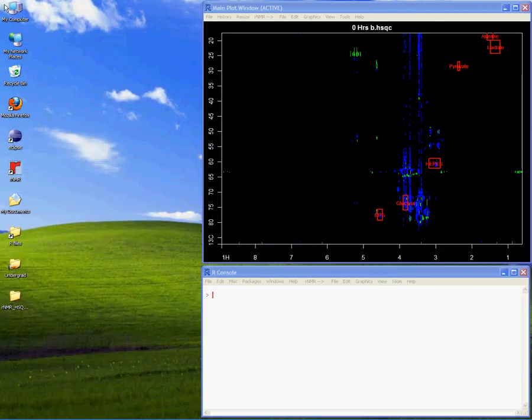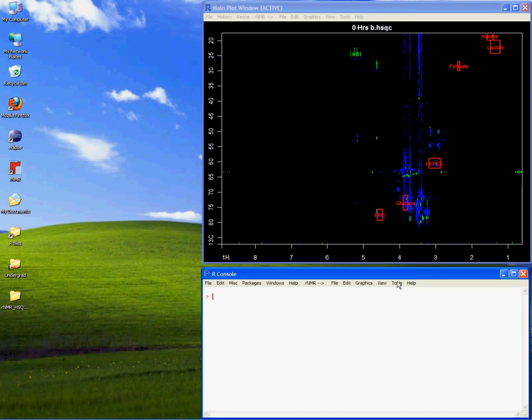In this video, I'd like to give a brief overview of RNMR and explore just a few of its many features. RNMR was designed specifically for NMR research in the metabolomics field. This specification is best exemplified through RNMR's most important feature, ROIs, or regions of interest.